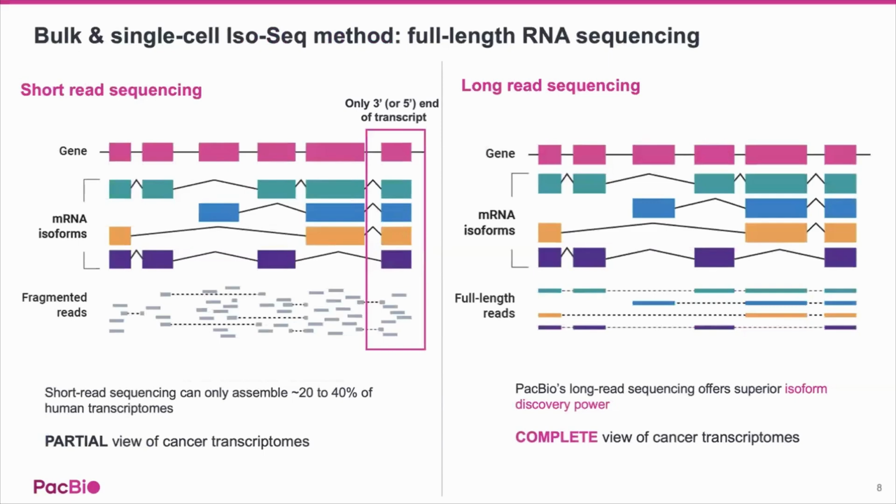Moving on to RNA sequencing, HiFi provides a unique capability to sequence full-length isoforms both at the bulk and the single-cell level. When using short reads in bulk transcriptomes, transcripts have to be computationally assembled, which becomes increasingly unreliable for genes that have complex alternative splicing patterns or novel isoforms. Meanwhile, in single-cell, short reads simply do not capture isoform information, but only the gene information.